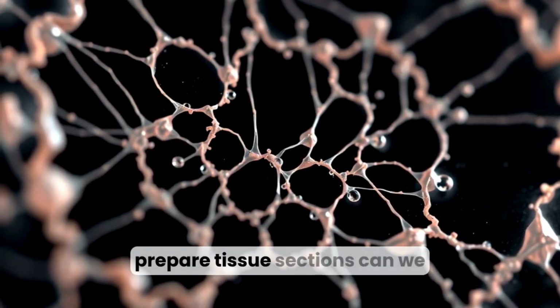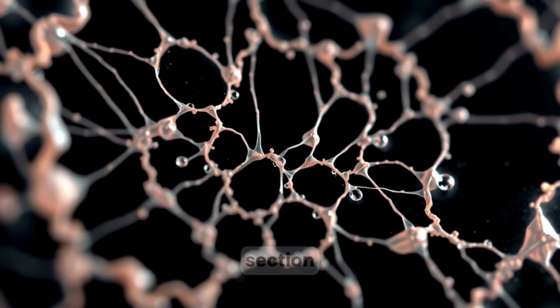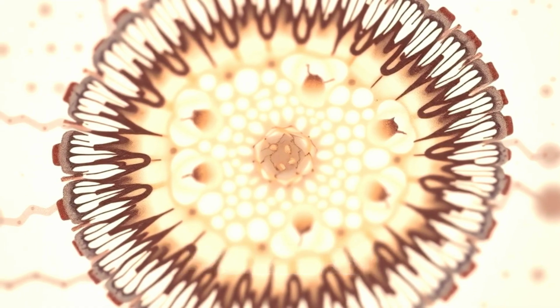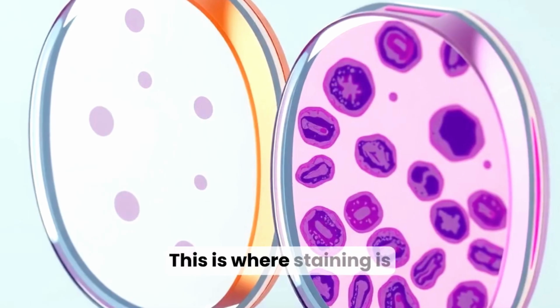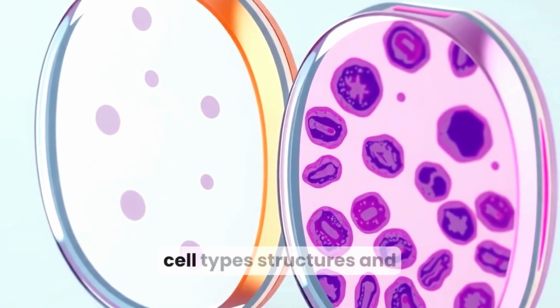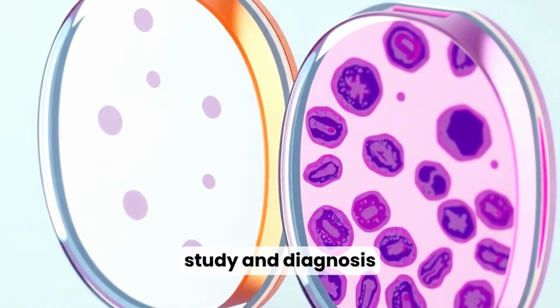When we prepare tissue sections, can we directly observe structure clearly with an unstained section? The answer is no. Freshly cut tissue sections are essentially colorless and transparent, making it difficult to distinguish cells and their architecture. This is where staining is crucial. Stains provide contrast, so we can identify cell types, structures, and patterns that matter for both study and diagnosis.